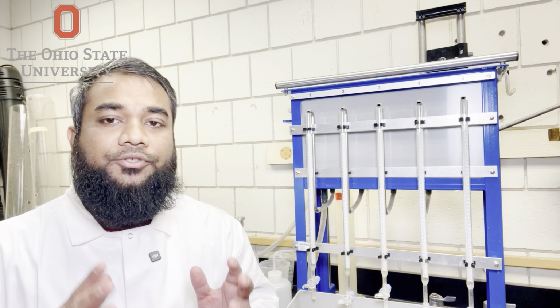In this video, I will demonstrate how to measure saturated hydraulic conductivity, commonly referred to as Ks, using the constant head method. This will be a live laboratory demonstration where I will show soil core preparation, saturation process, constant head setup, flow measurement, and calculation and interpretation of saturated hydraulic conductivity.